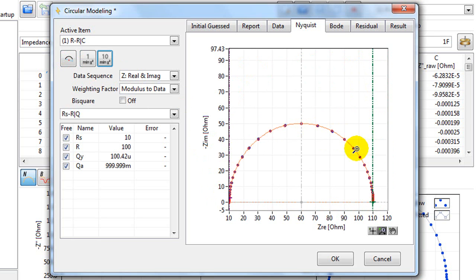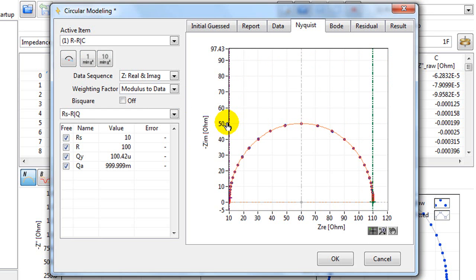If your data has multiple circles, you should move the lines again to encompass the new circle.